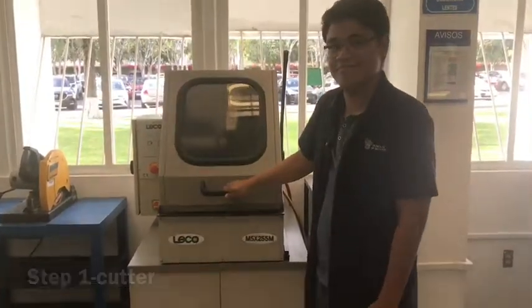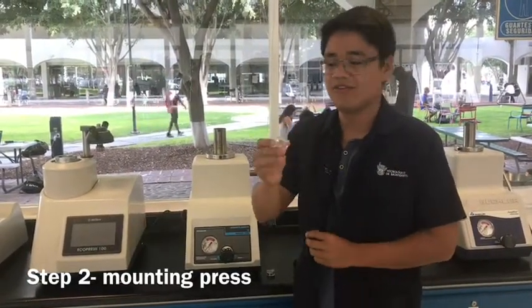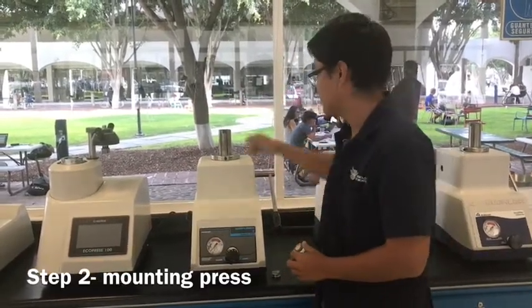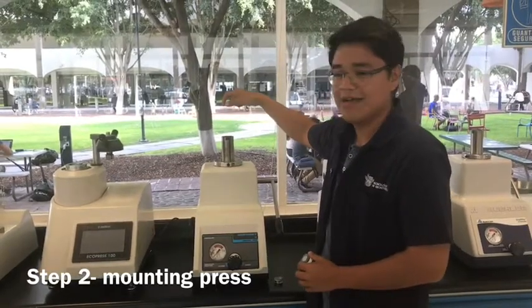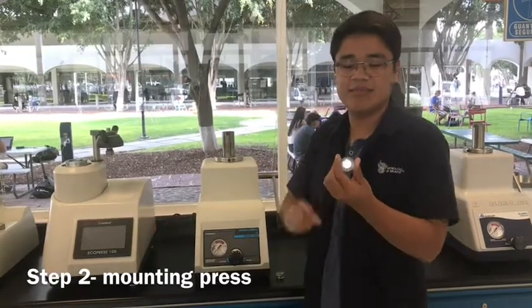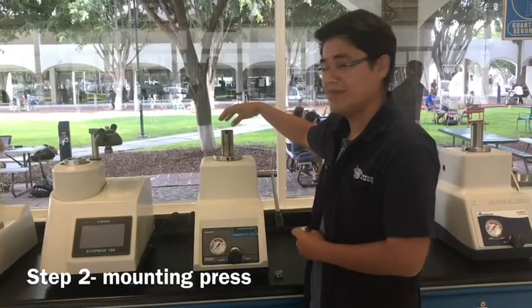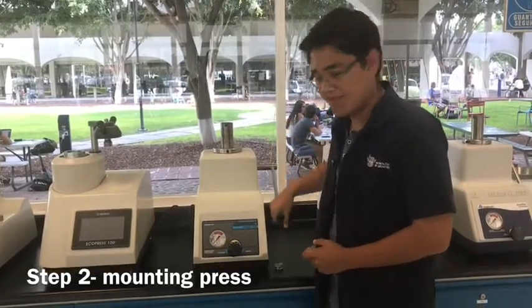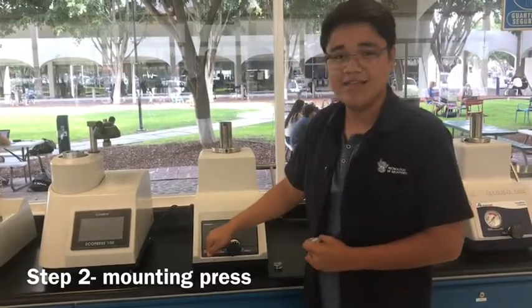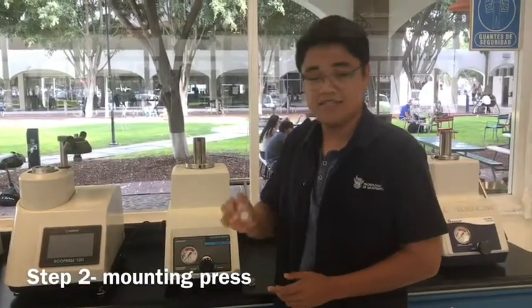Here we have the mounting press machine that is used to get the sample like this. You can put it in the holder, and it is very easy to use. Just clean this part, apply the spray to prevent the base from sticking to the sample. Then add the bakelite, then the pressure, and you have to adjust the pressure in the machine to 5 units, and it has to last about 10 to 15 minutes depending on the material.